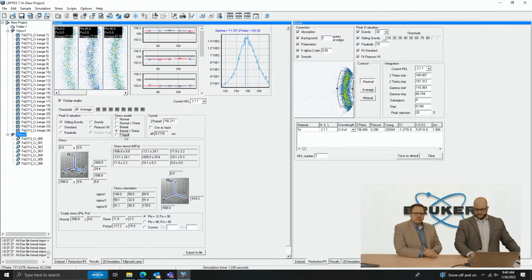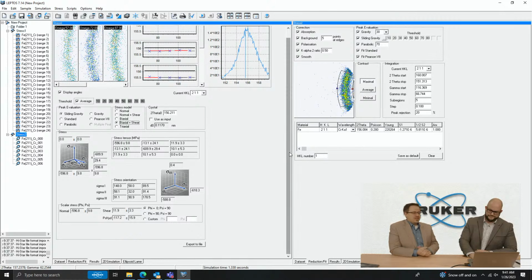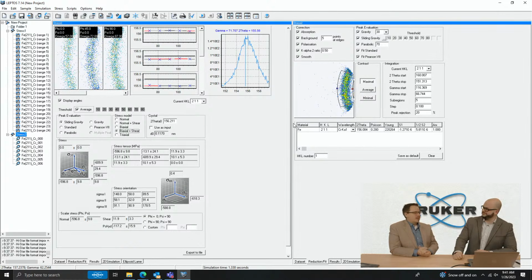That also gives you an option to go triaxial, but like we said, if you don't know the stress in the z direction, which is probably 0 through assumption, then you would need the stress-free d-spacing to get that. In a classic material, if the stress on the surface pointing out is not 0, the surface doesn't exist. It's going to blow up. Exactly. But in kinetically limited regimes these days with growth and that, you never know.